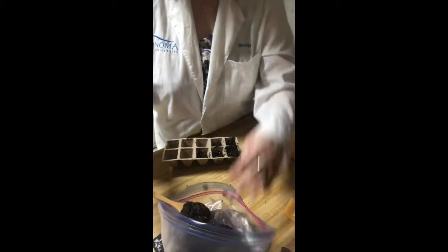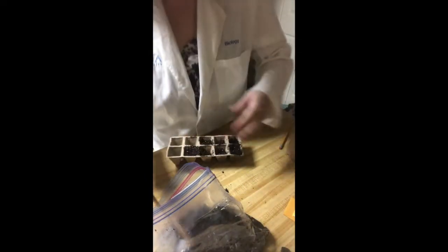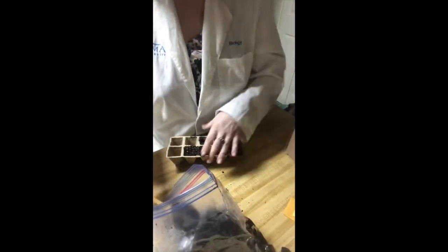One thing you'll notice as you're filling the cells up with dampened soil is that the peat pots, when they become damp, are going to get a little bit flexible. So you're going to want to be real gentle when you're moving this around so that they don't tear or break apart.